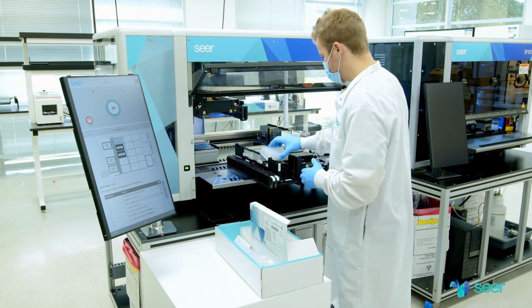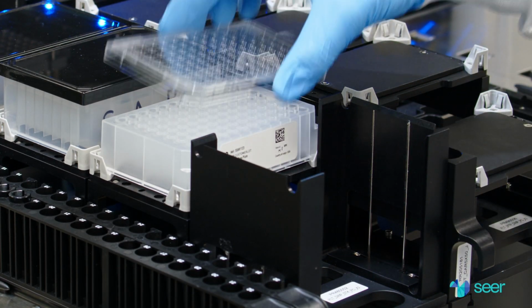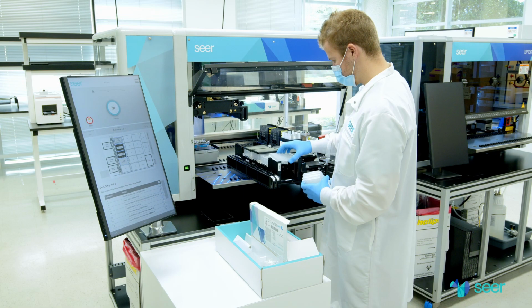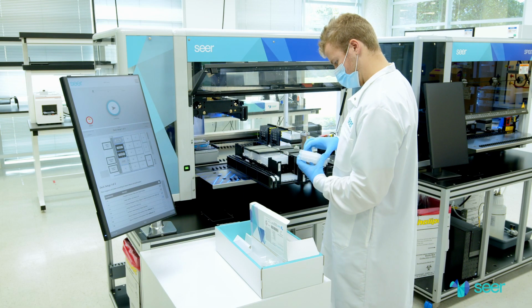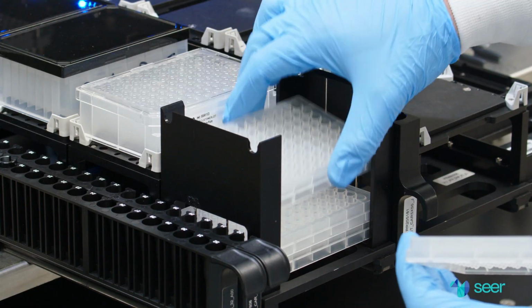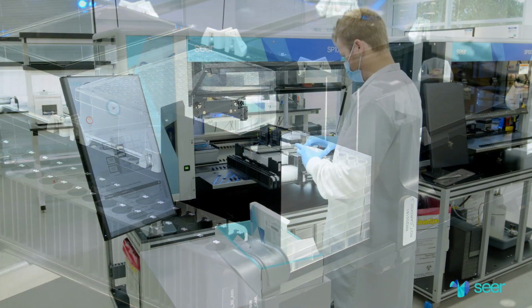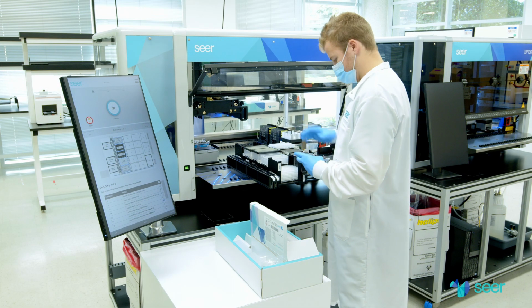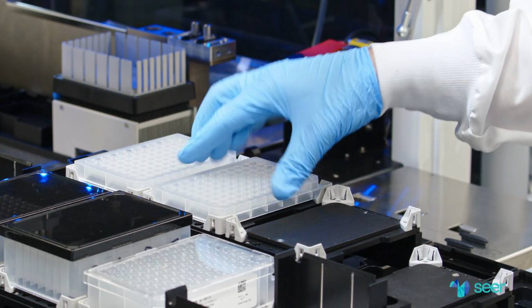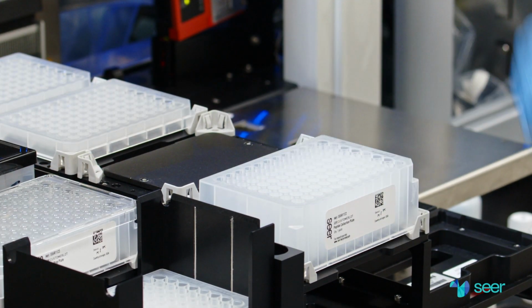Place the sample prep plate in position A4. Cover with a clear plate lid. Follow the prompts on the ICS to load 4 intermediate plates in position A5. Ensure that well A1 is in the top left corner for all 4 plates. Follow the prompts on the ICS to load the intermediate plates in positions B2 and B3. Place the peptide collection plate in position B5.